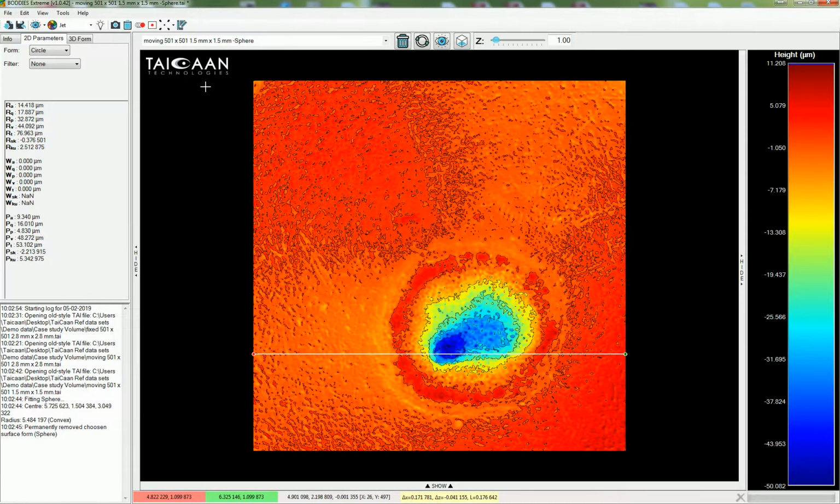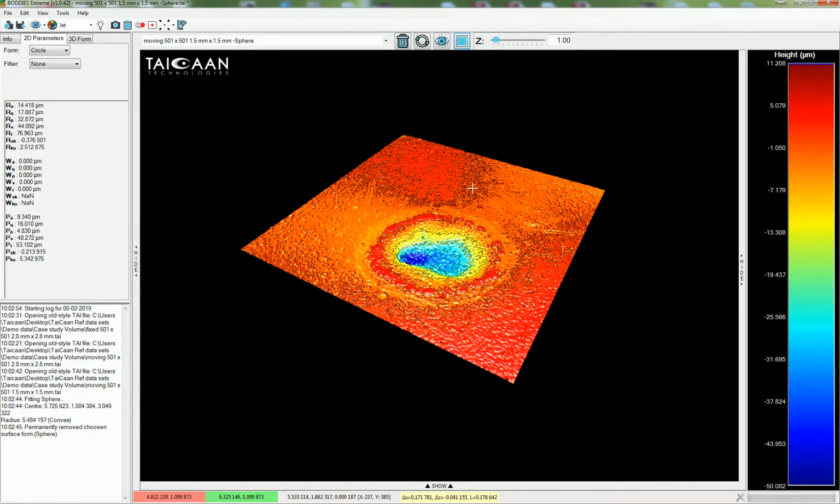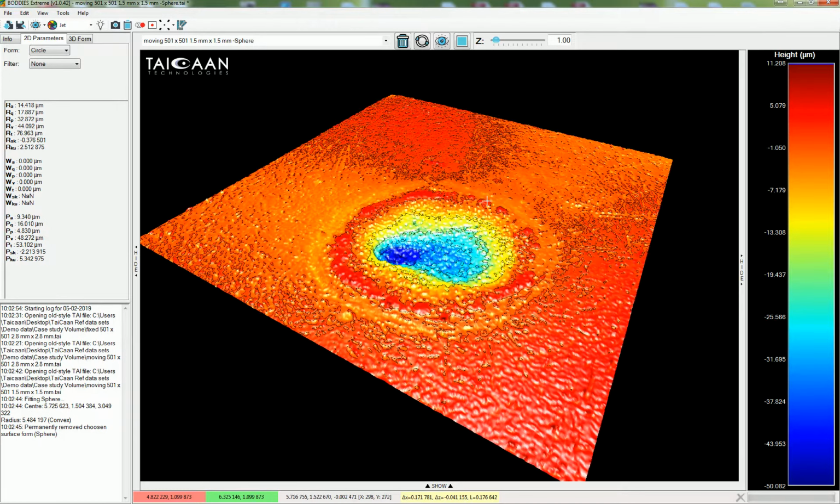So just by hitting that function, I'm replacing the data, and now I think you can see we have a very nice representation here of the surface. And I think you can see intuitively that from all of the views here that we have a nominally flat surface, and we have a crater region which actually has a crater rim which is higher, which is above the level of the datum surface.